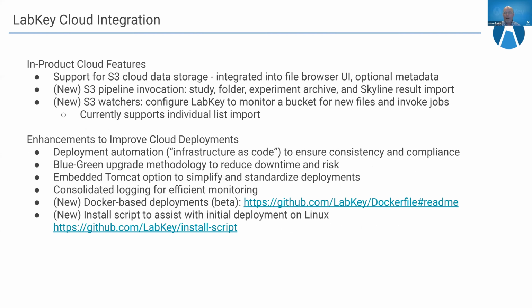And brand new, hot off the presses, I mean, literally code going into the product yesterday, is the ability to have an S3 watcher. Like a file watcher works on a file system, an S3 watcher works on an S3 bucket, where LabKey is now able to monitor an S3 bucket for new files and invoke pipeline jobs on those files. I won't go into all of these, you can read them, but we've made a lot of enhancements to improve cloud deployments, to make it much easier and faster to automate and manage the deployment of LabKey within the cloud.